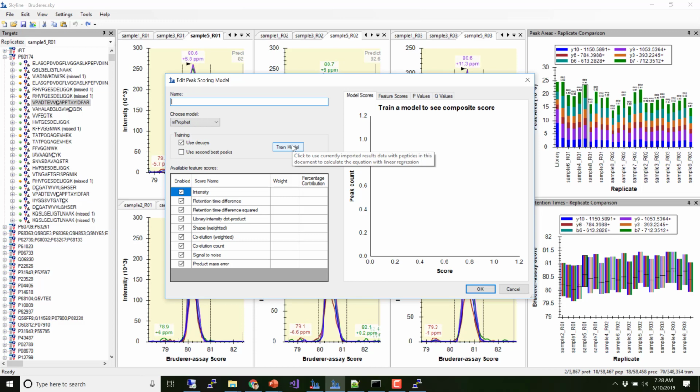Yeah, it'll use summarization, and so it will not use the value. If it's got too low a Q value, we'll use statistical methods to come up with a replacement value. And so anyway, here we are.